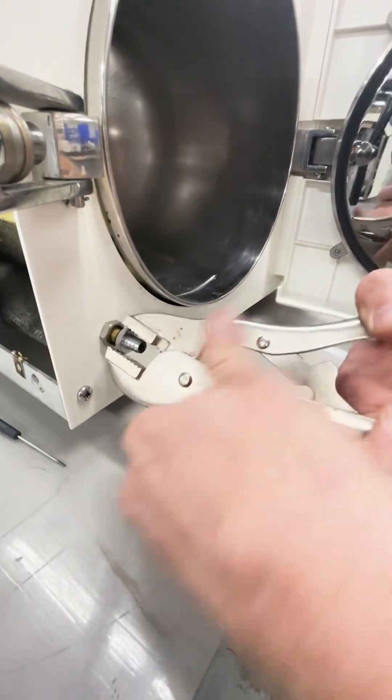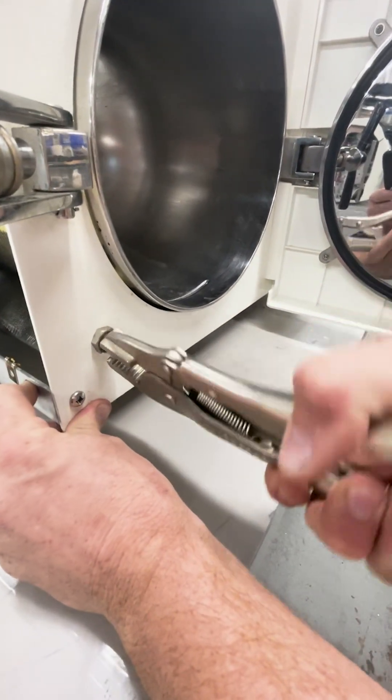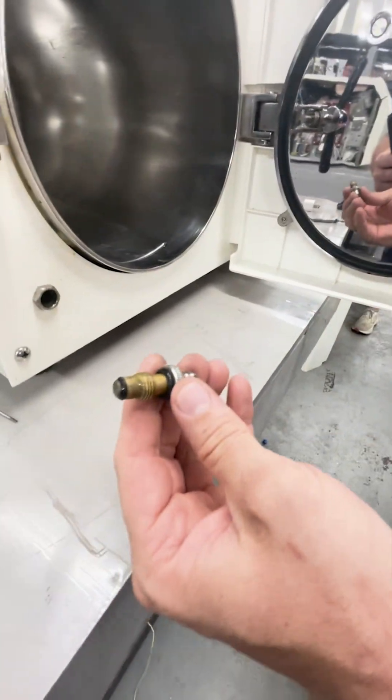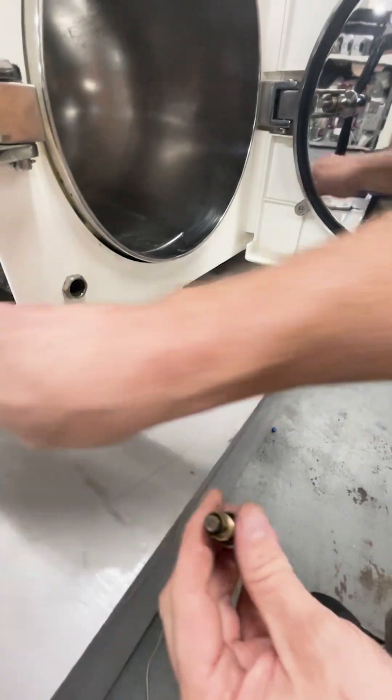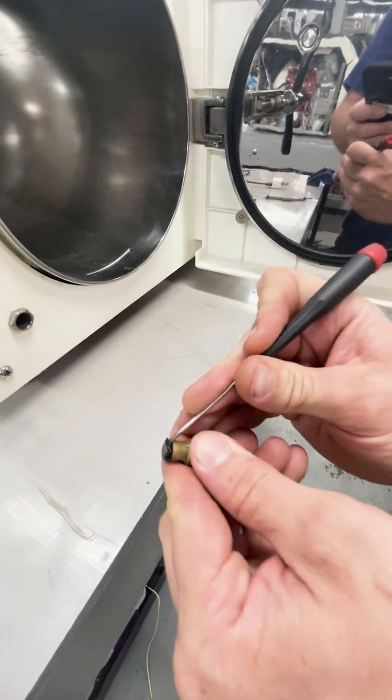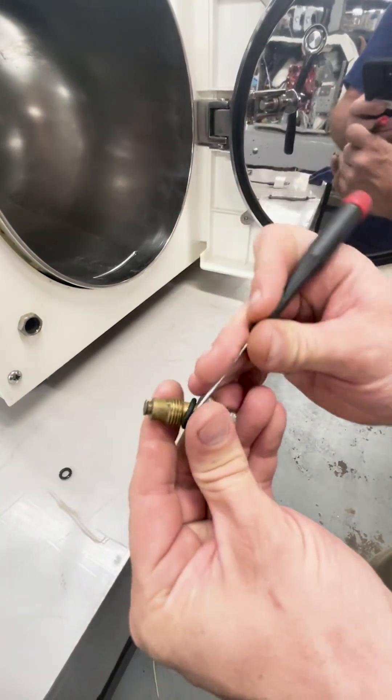Twist and pull — it's just getting hung up on the old o-ring. Once that comes out, I'm going to use a small flat head to pry off the old o-rings.